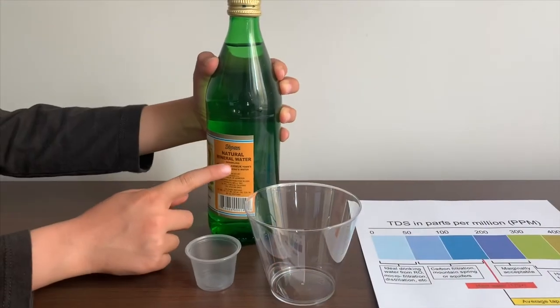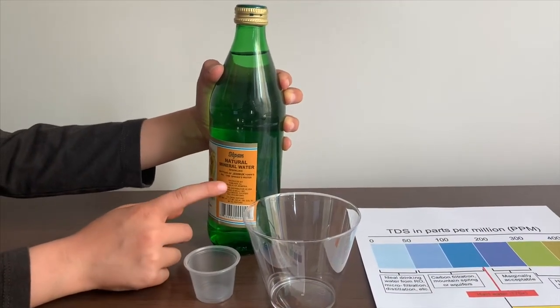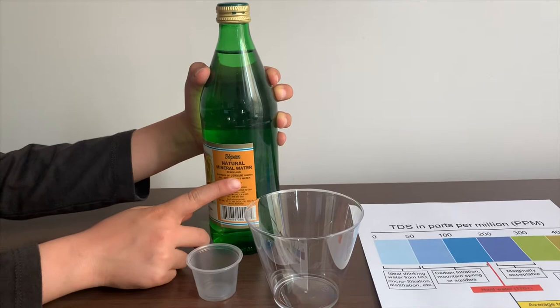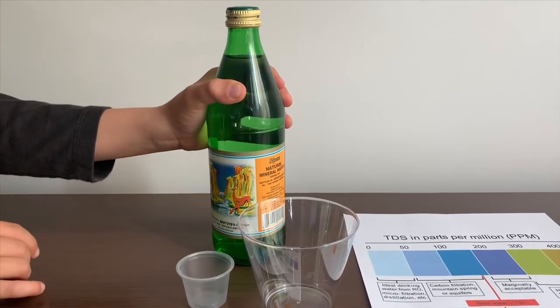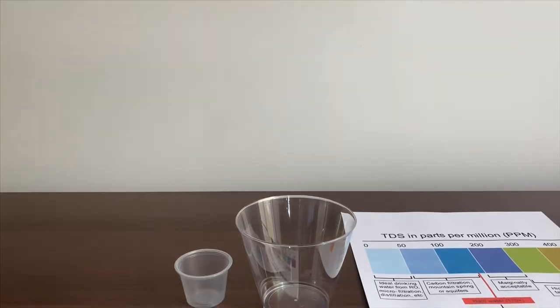This is Sipan Natural Mineral Water. It's sparkling water and it's sourced from Jermuk, Armenia. It costs $1.49. Let's test the pH and TDS levels.